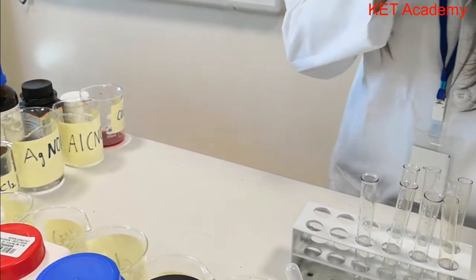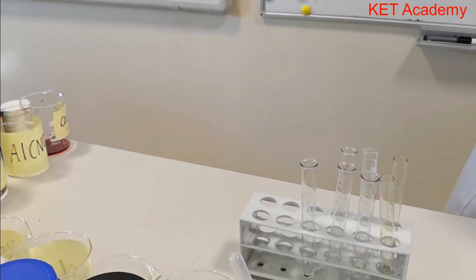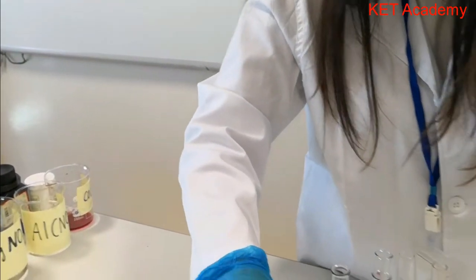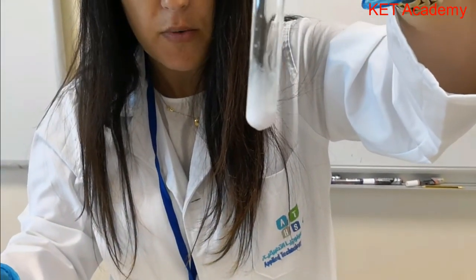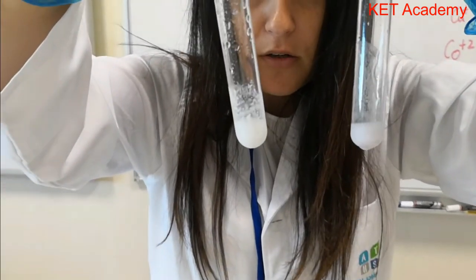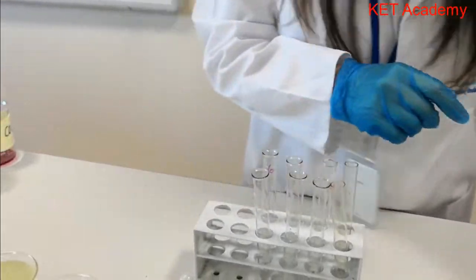Now let us try the lead. Let's start with the transition metals. A solution of lead nitrate. With sodium hydroxide, it also gives a white color. So here, this is the other white color we have. So we need to do some more tests to differentiate between lead and calcium.